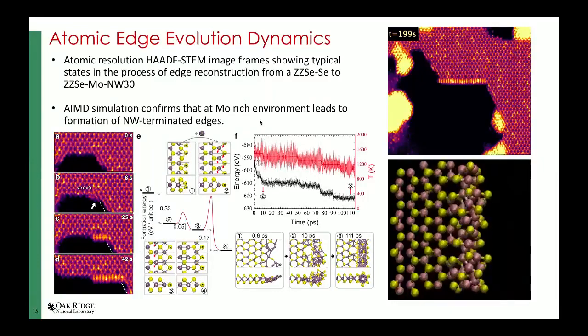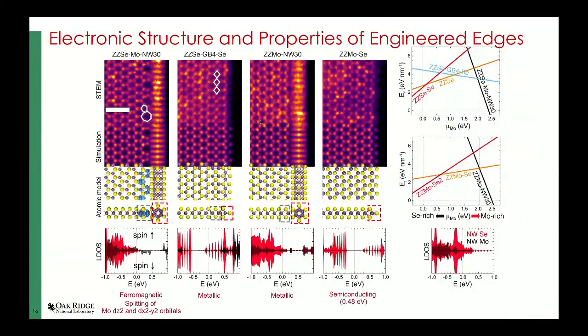So here's the bread and butter of my presentation. What I'm trying to convince the audience in the webinar today is how you can use two-dimensional materials, how you can tune the edge structure, and how we can use the electron microscope to transform one semiconductor material to something that has new and novel functional properties.